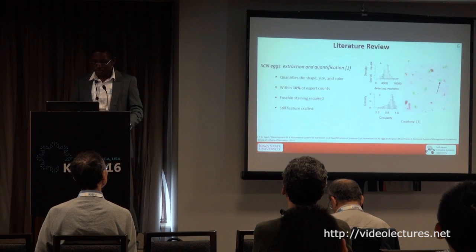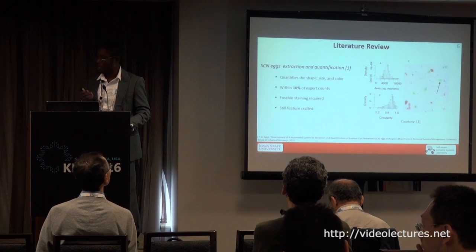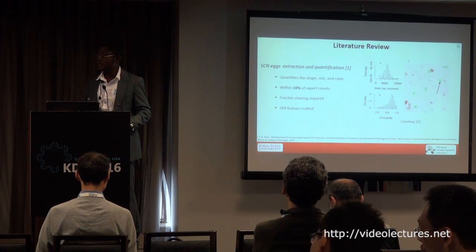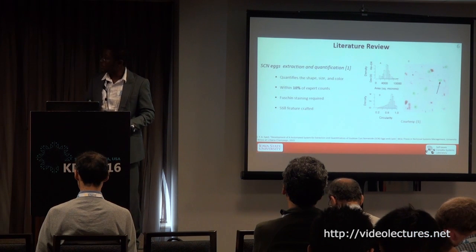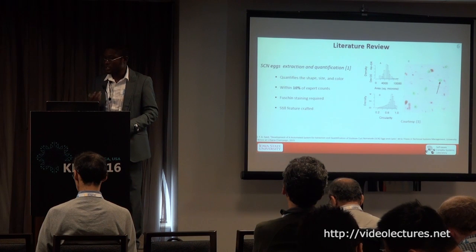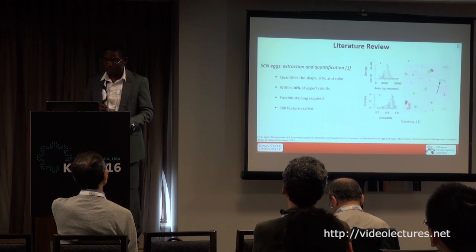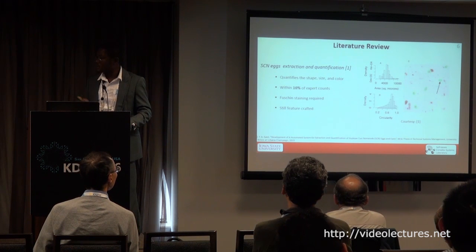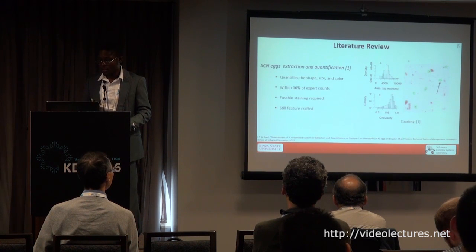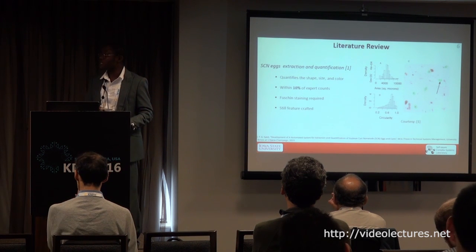We were told by the experts, the farmers and pathologists, that many computer vision approaches have been tried and have failed, so they are not reported in the literature. However, there is a master's thesis at the University of Illinois Urbana-Champaign, where they coded and crafted features of the eggs, which are the shape, the colors, and the size, and were able to come within 10% of expert counts.